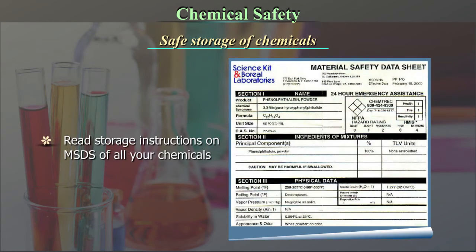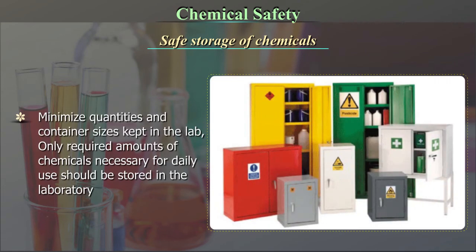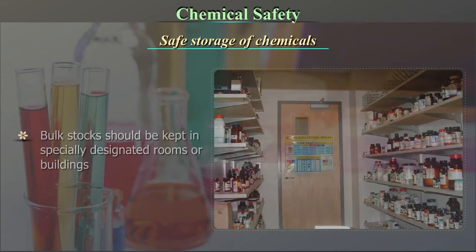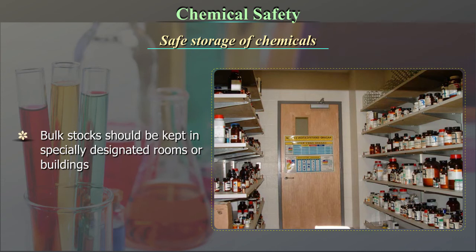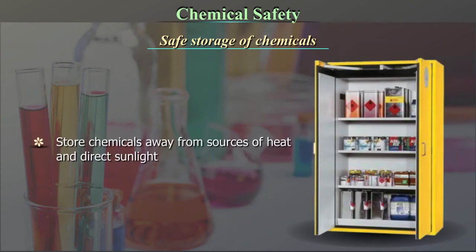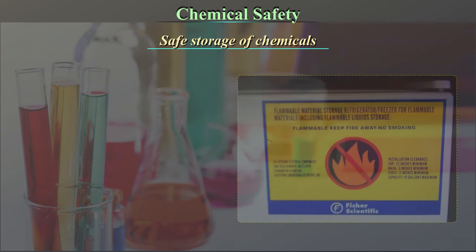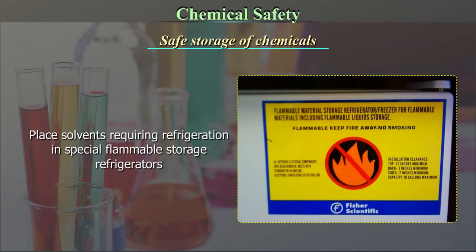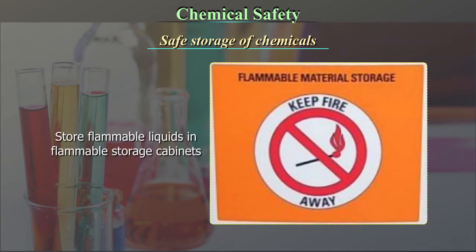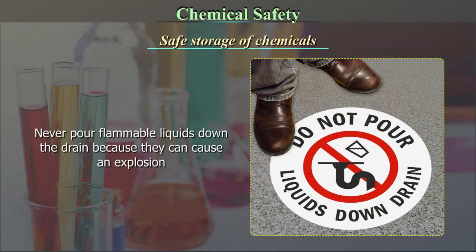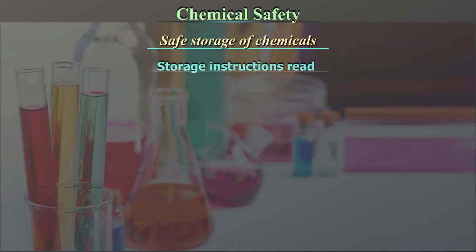Additional labeling requirements: include date of preparation and/or date placed in service, and the date of expiration wherever warranted. Unlabeled containers of chemicals should not be opened. Labels can be purchased or custom made by the laboratory. Safe storage of chemicals: read the storage instructions on the MSDS of all your chemicals. Minimize the quantities and container sizes kept in the lab. Only the required amounts of chemicals necessary for daily use should be stored in the laboratory. Bulk stock should be kept in specially designated rooms or buildings. Store chemicals away from sources of heat and direct sunlight. Do not store hazardous liquids on shelves above eye level. Place solvents requiring refrigeration in special flammable storage refrigerators. Store flammable liquids in flammable storage cabinets. Never pour flammable liquids down the drain because they can cause an explosion.